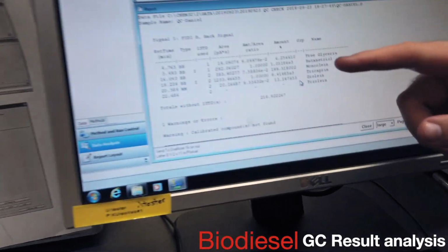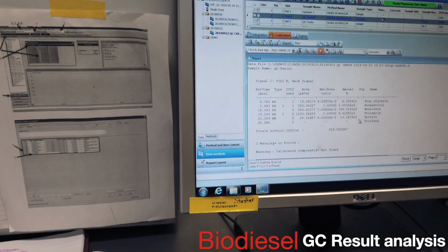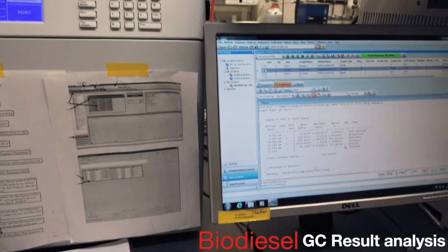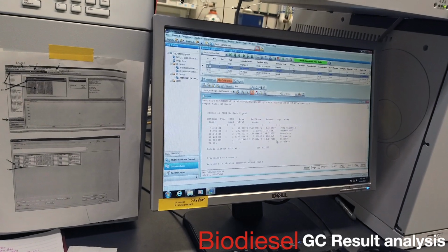Free glycerin is like 0.005 and this says 6. Right, but you see what I'm saying? There's like a multiplier of 100 in there, and I don't know where that's coming from. I know how to fix that. That was my fault. I just put the numbers in because I wanted to not waste people's time, because I could tell that they were starting to get lazy.